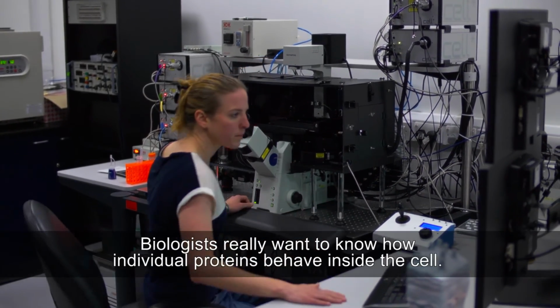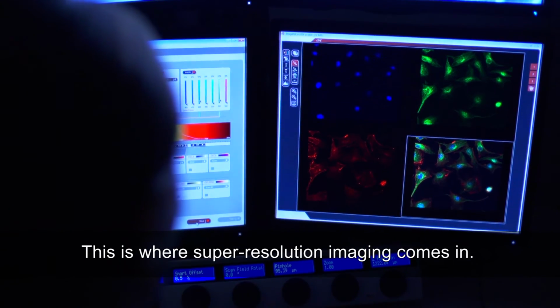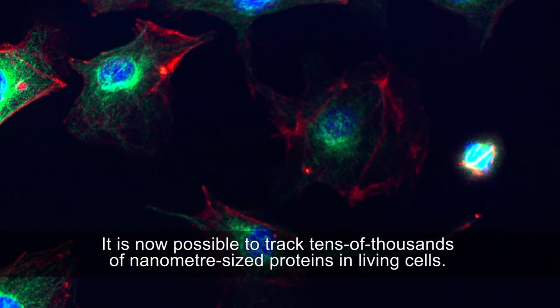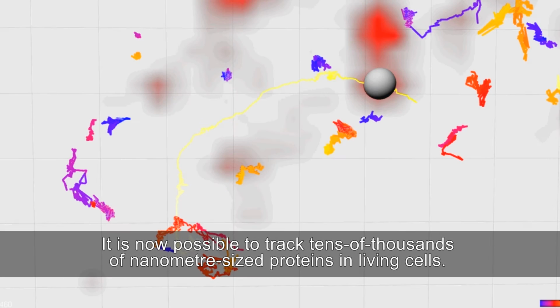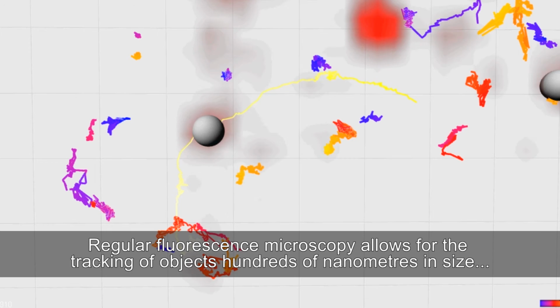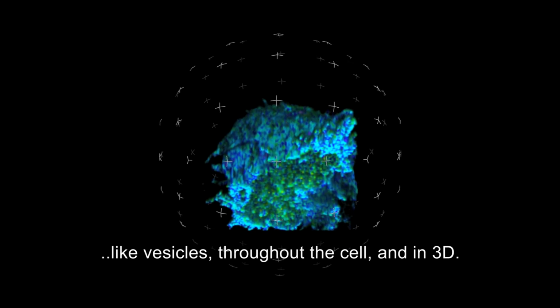Biologists really want to know how individual proteins behave inside the cell. This is where super-resolution imaging comes in. Super-resolution techniques emerged recently and are continually being developed. It is now possible to track tens of thousands of nanometer-sized proteins in living cells. Regular fluorescence microscopy allows for the tracking of objects hundreds of nanometers in size, like vesicles, throughout the cell, and in 3D.